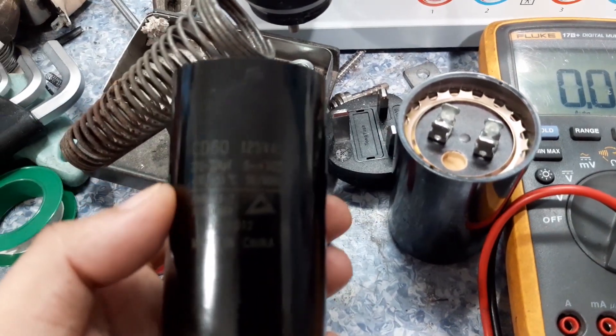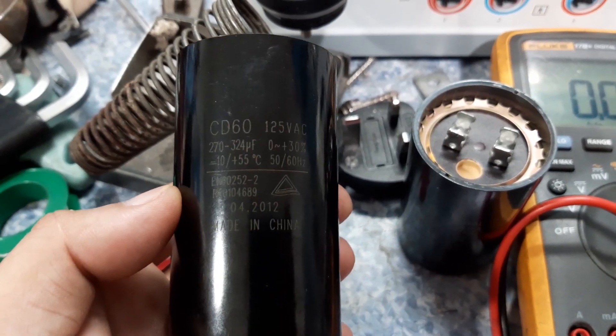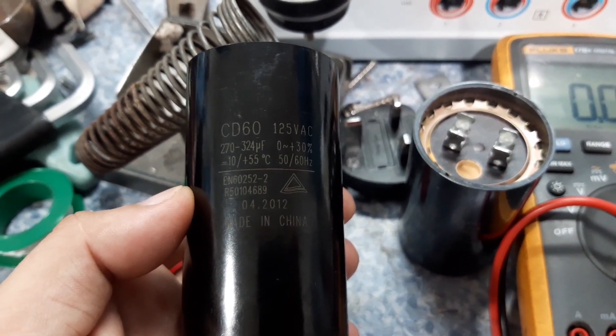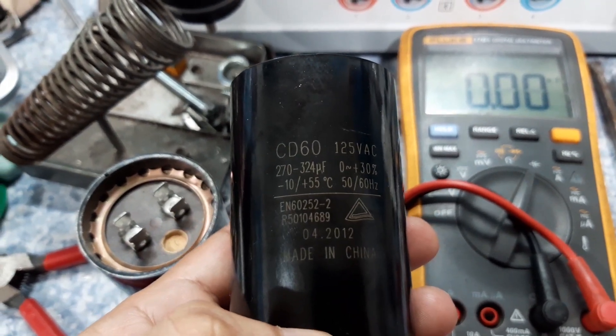I have already removed the capacitor — this is the old one and I also have the new one here. What we are going to do now is to test the capacitor using the multimeter and we will see if it is defective, so we will replace it.